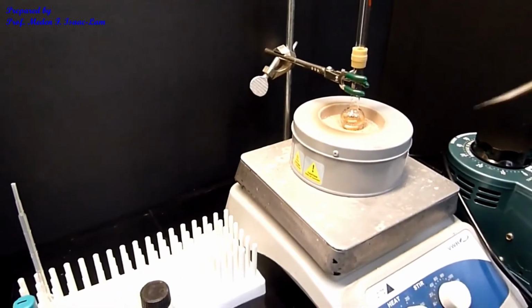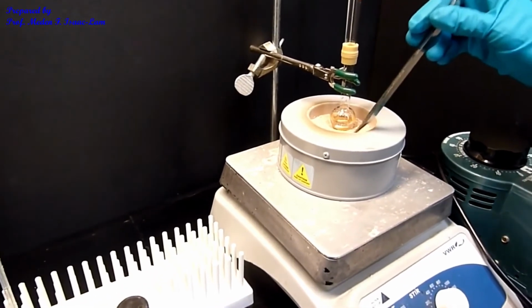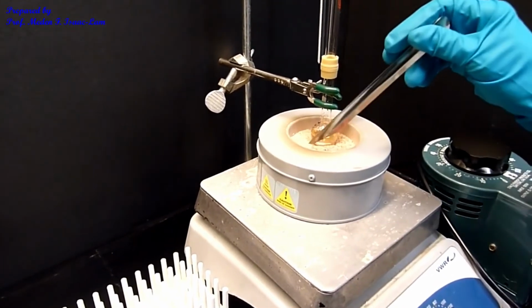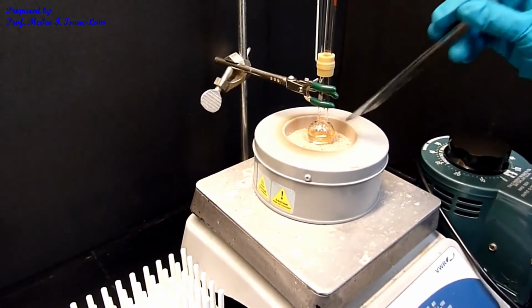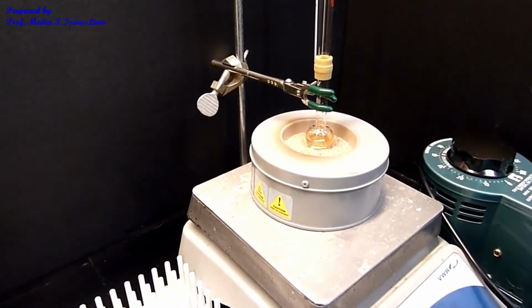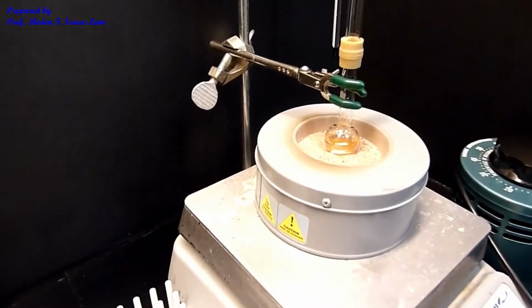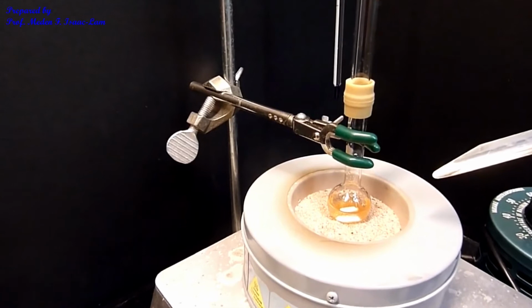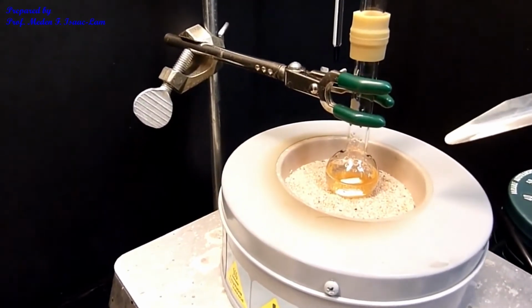I have the flask sitting on the sand bath, and I don't want it to be popping so much. The temperature right now is close to 150, so I'm just putting it right on top so it's not popping. And this would act as a condenser so that I'm not drying the solution.